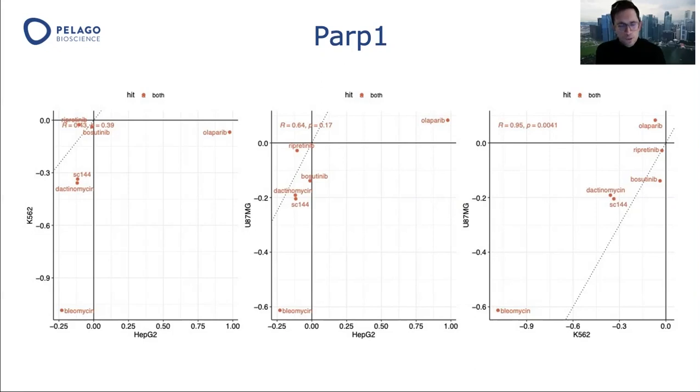And it should also probably be noted that what we're looking at here is probably not the true destabilization. It's more likely that it's PARP degradation. That's a well-known inactivation process in systems where DNA damage is extensive, which is basically what bleomycin is causing. However, that doesn't seem to be the effect in the HepG2 cells, which have this kind of reversed response pattern to these drugs. So very different cell line activities here.